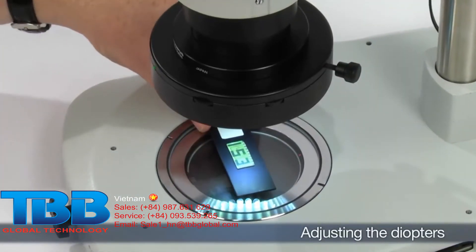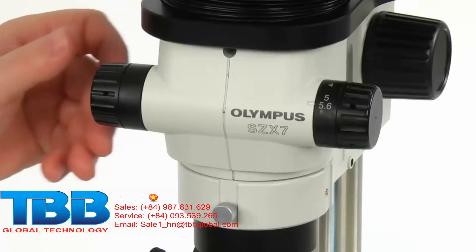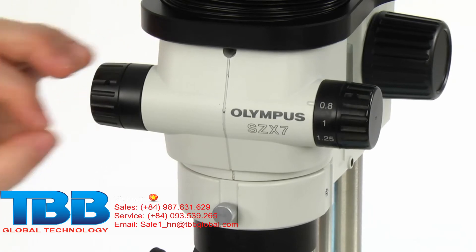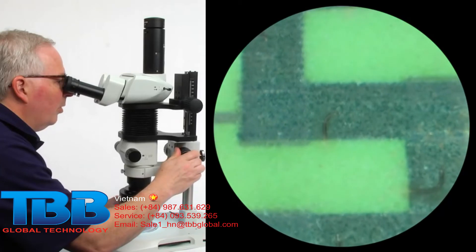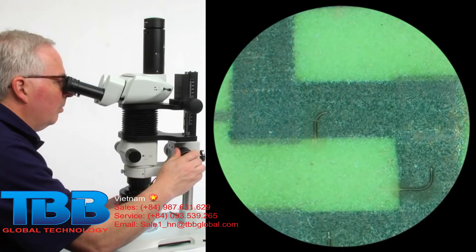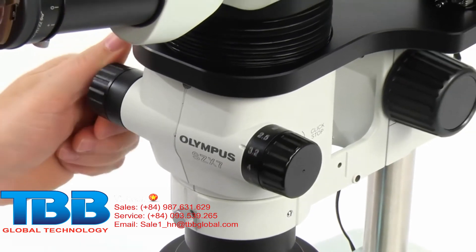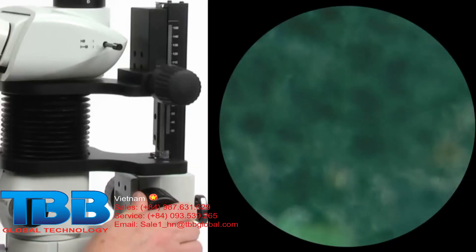First, place a simple large sample that will be easy to observe on the stage plate. Set the zoom adjustment knob for the lowest magnification and rotate the focus adjustment knob to bring the sample into focus. Next, set the zoom adjustment knob for the highest magnification and rotate the focus adjustment knob to bring the sample into focus.